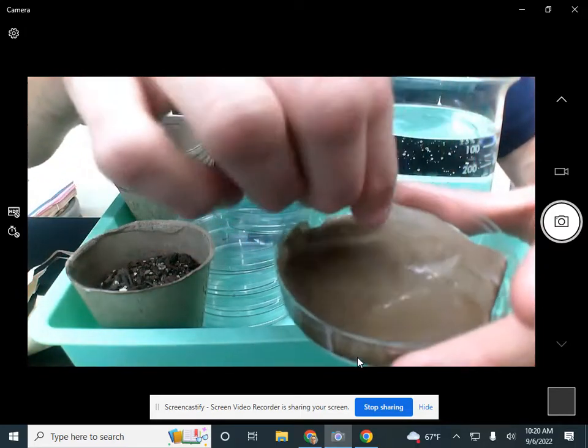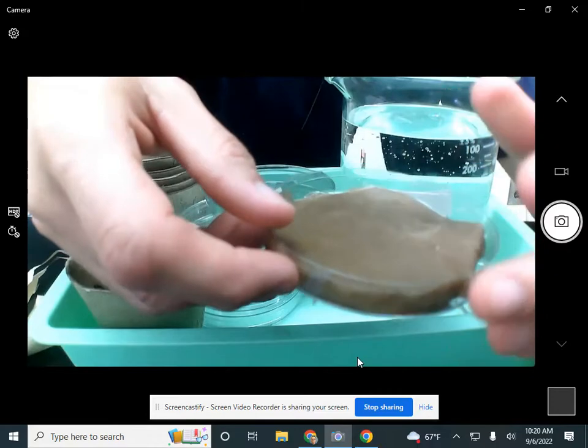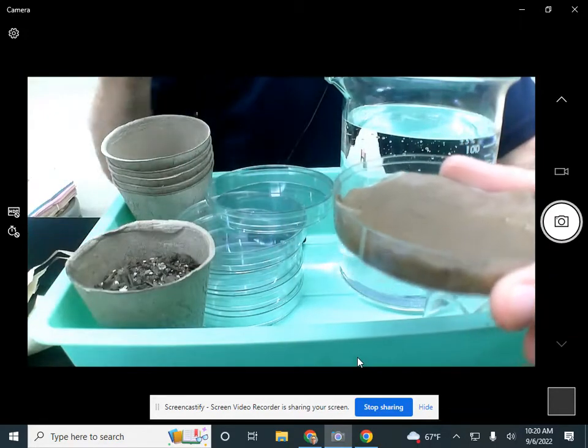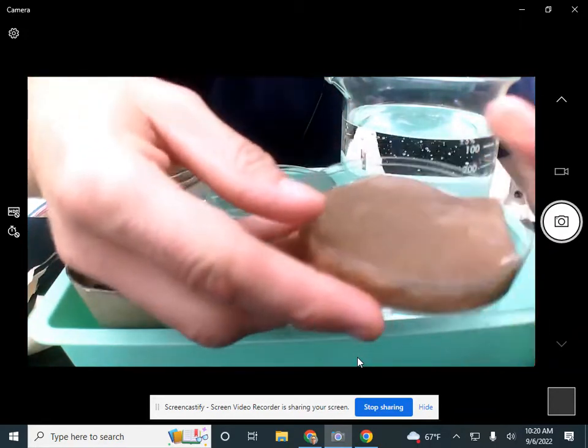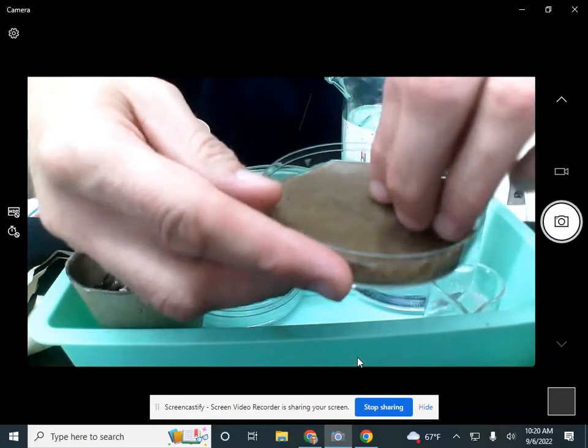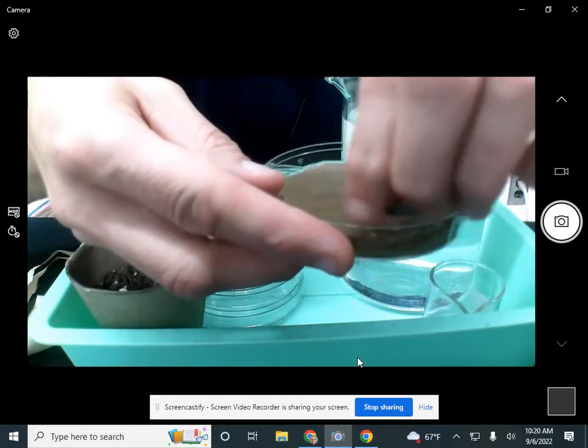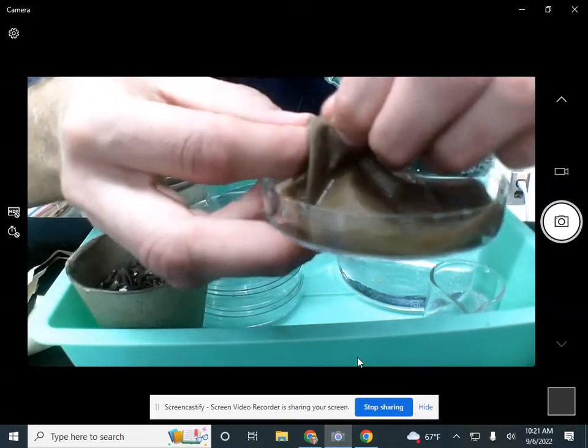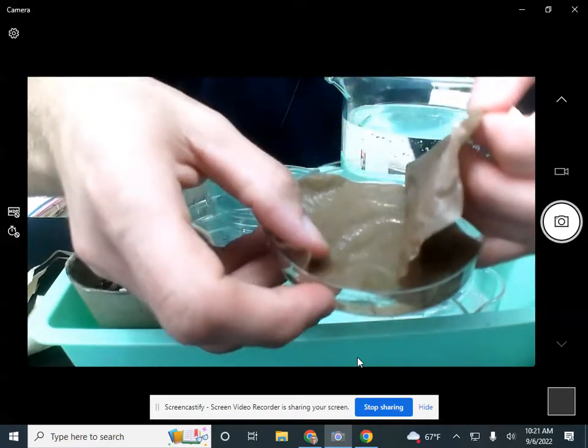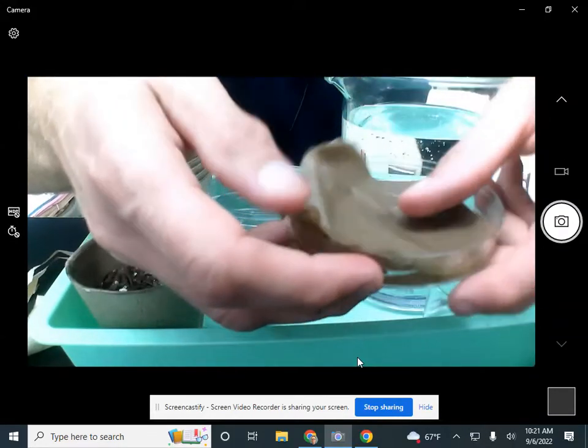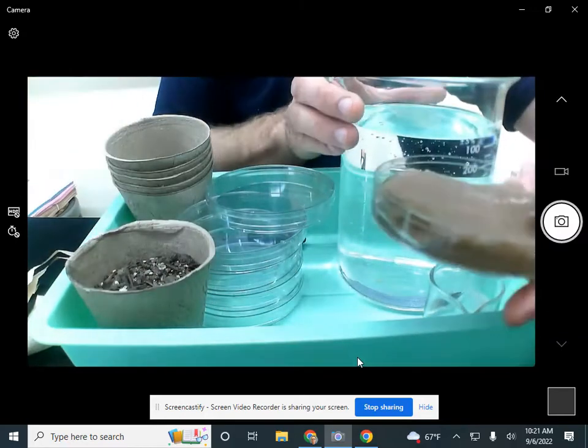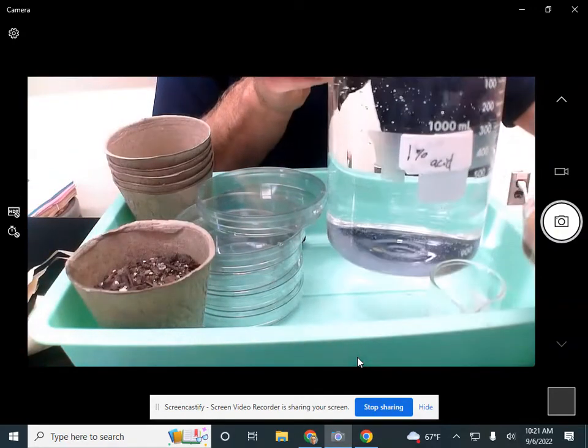And that's what I've done here. A little trial and error. I have a paper towel that's a few layers thick, and then you're going to put your seeds on there. You can do a few layers of paper towel. Put your seeds kind of in the middle, like they have a little blanket on top, and then water them with some of your percent acid.